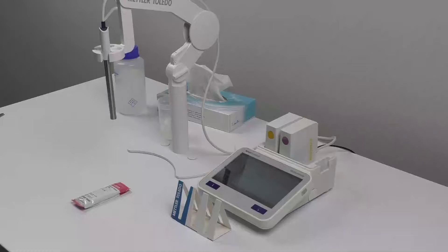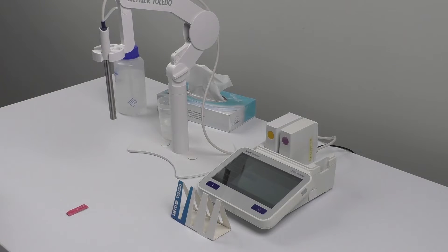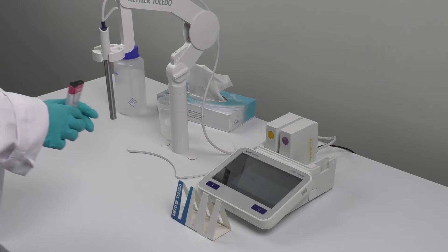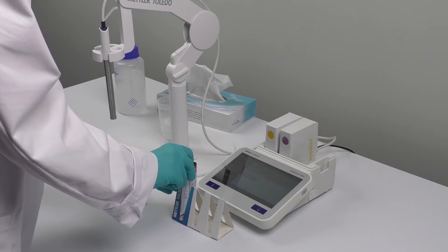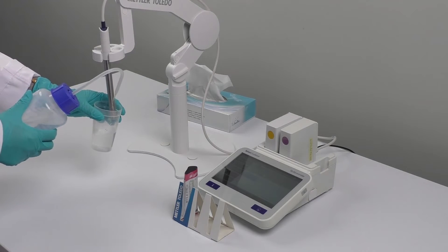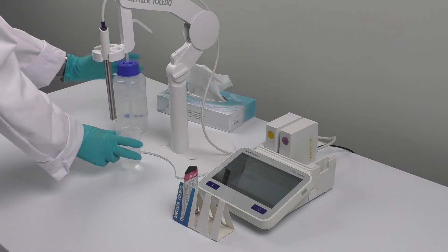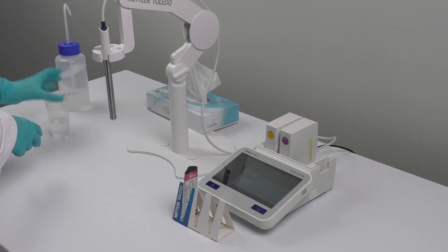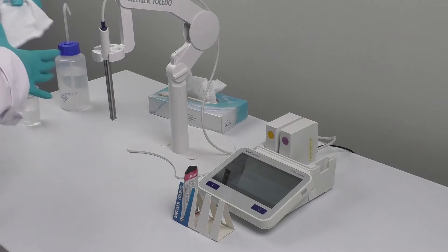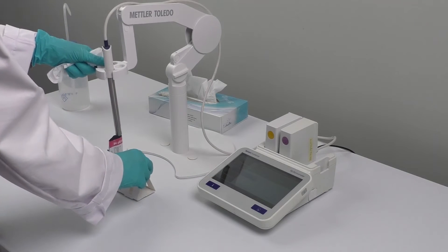The recommended standard for verification is 84 microsiemens per centimeter. To perform verification, you need a sachet with the standard, a sachet holder, deionized water to clean the probe, tissues, and a waste beaker. Open the sachet with the scissors and place it on the sachet holder.